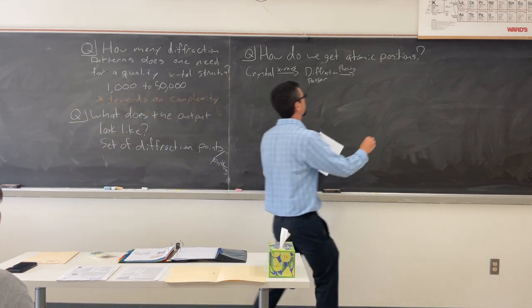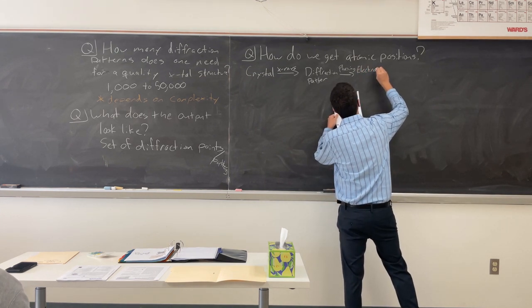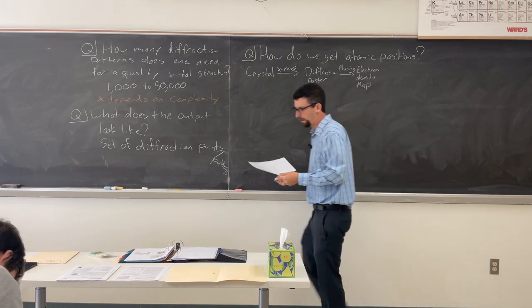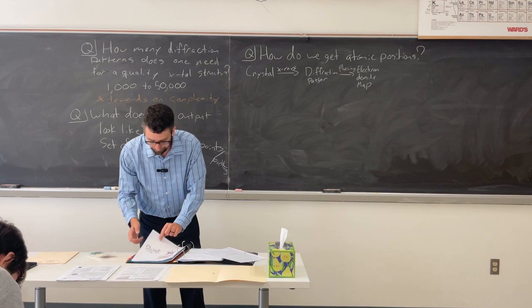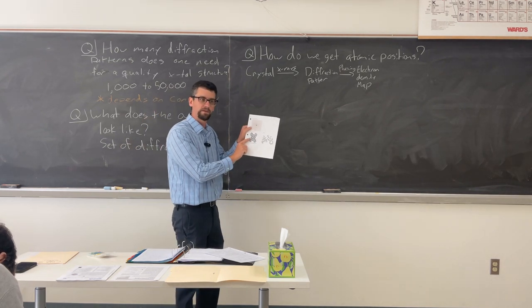We move to an electron density map. Now, what I want you to do is check out that electron density map that we have here.